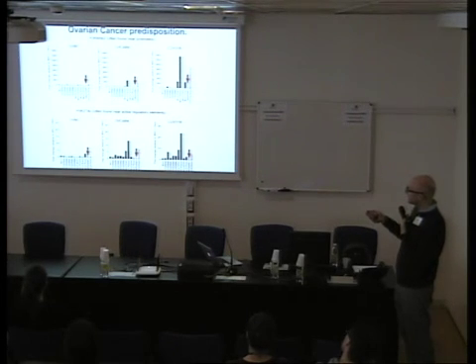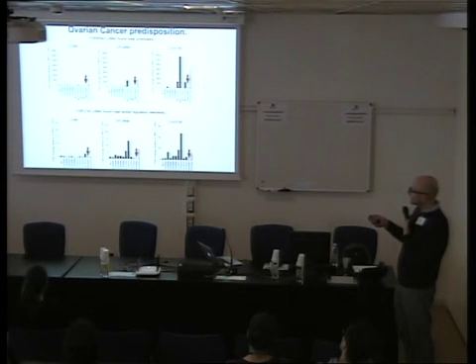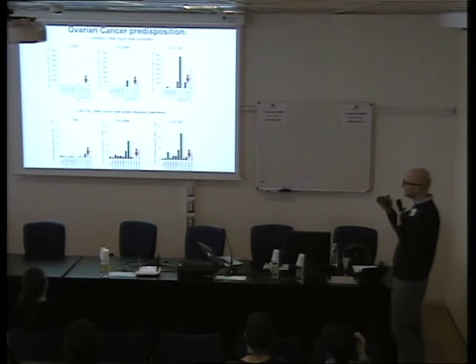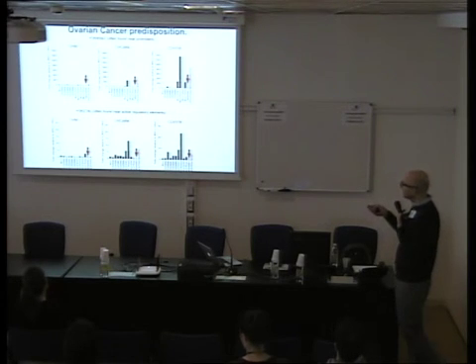These are three different ovarian cancer cell lines. This one does not express BNC2, this one has intermediate levels, and instead COV318 is one of the cells with the highest expression levels of BNC2.